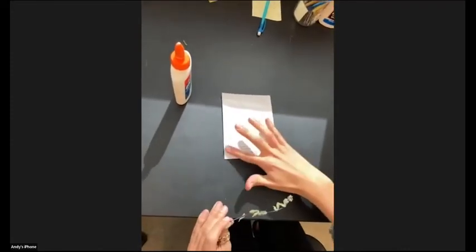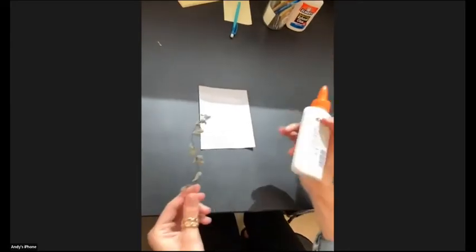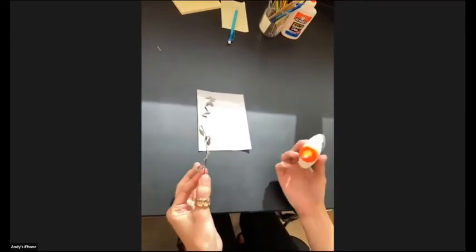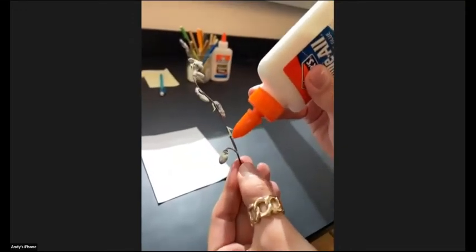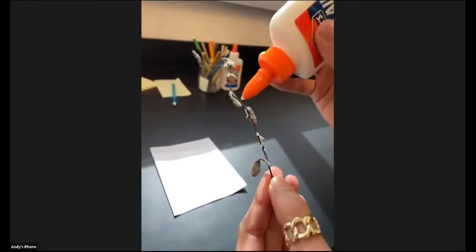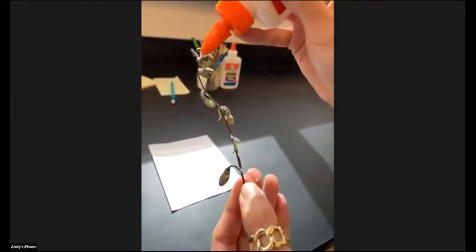Alrighty. So once that is done, hope everyone's around there. We're gonna go ahead and use some of the glue and place it on the specimen directly. And again, trying to use small amounts to help with faster drying. You can put little dots on the leaves, the flowers.